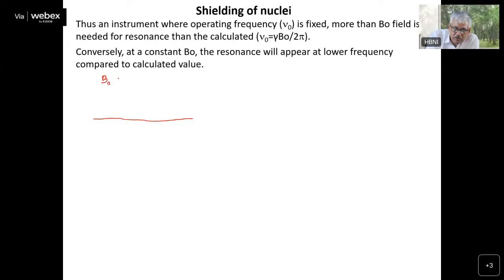If there is no shielding, you could have expected a particular nucleus to resonate at this position.